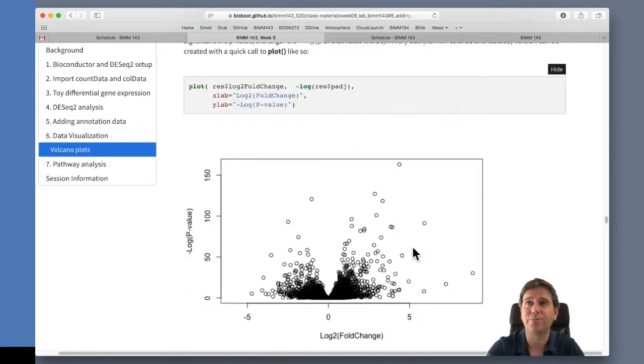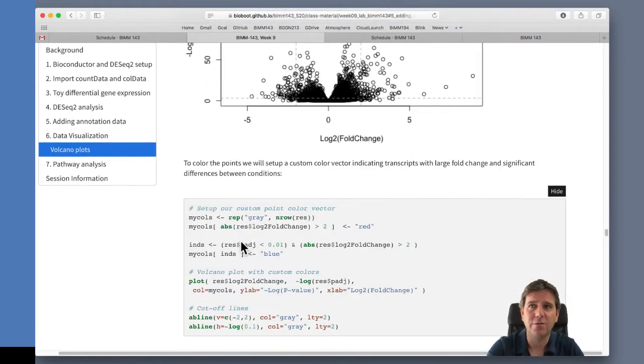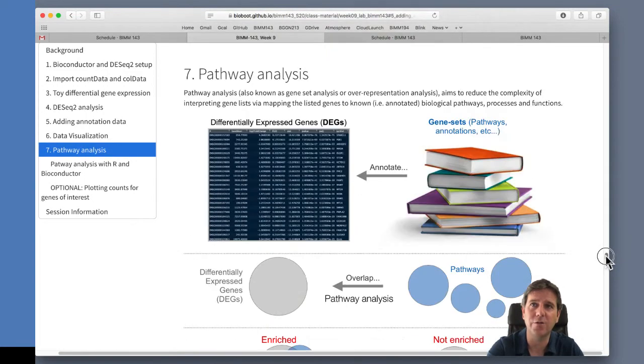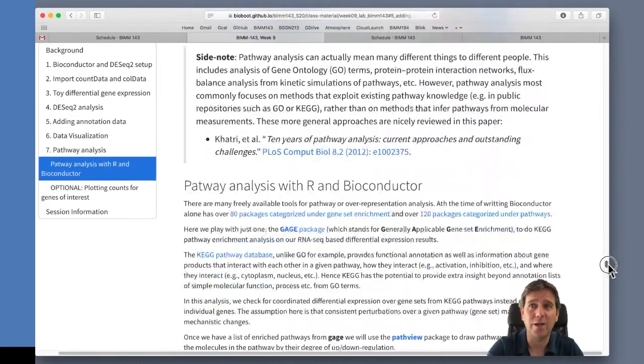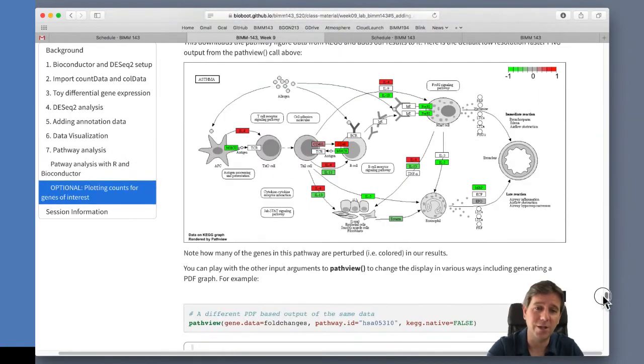We're going to add the volcano plot. Yeah, let's do that first because that'll focus things in. What I was mentioning is we were going to take our subset of genes and map them to pathways here. So the next step would be to do this pathway analysis and find out which genes are regulated, and we'll see results like this.